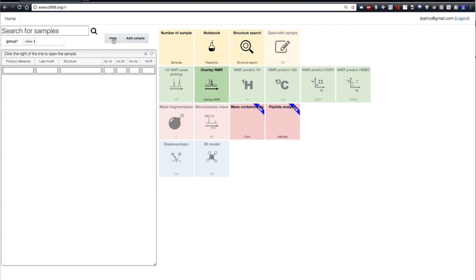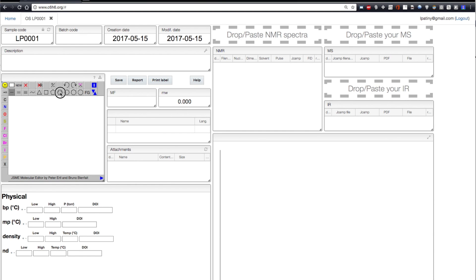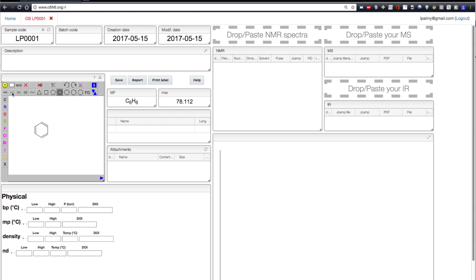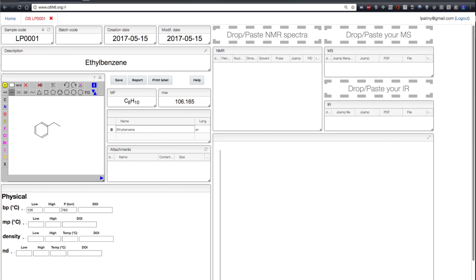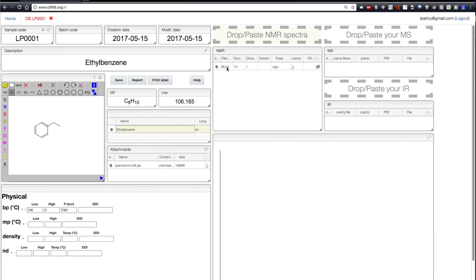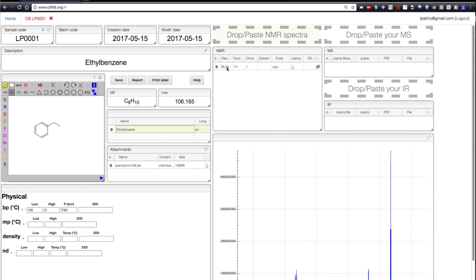Let's start by adding a new sample. After login, you just get an empty page where you can draw the molecules. You will see that the molecular formula and molecular weight are calculated automatically. You may add names, boiling points, melting points, but you are also able to drag and drop an NMR spectrum and visualize the data directly online.